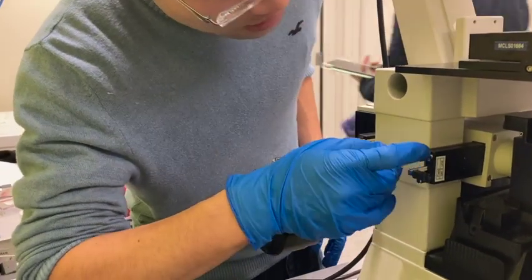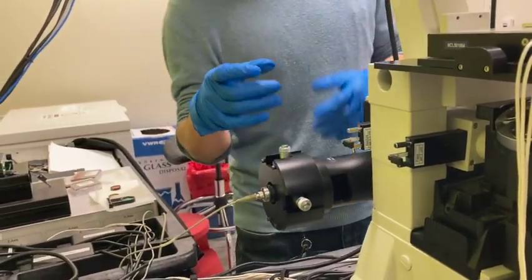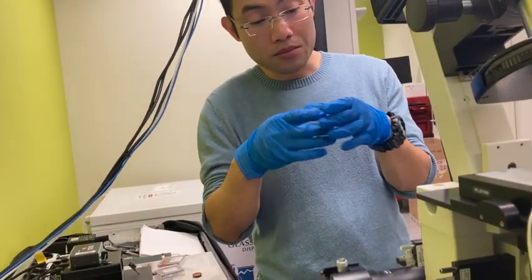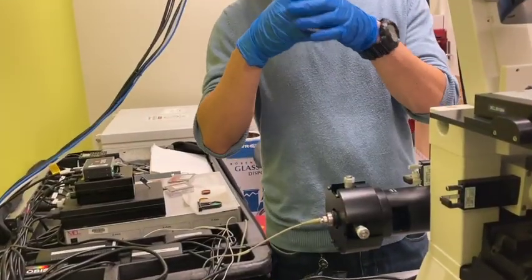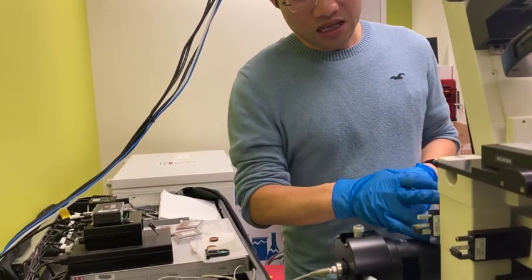And this is for the field diaphragm. The difference is the field diaphragm, by definition, will change the field of view. Make it smaller here and you will have a smaller field of view, and you can expand it. And this is the aperture diaphragm.